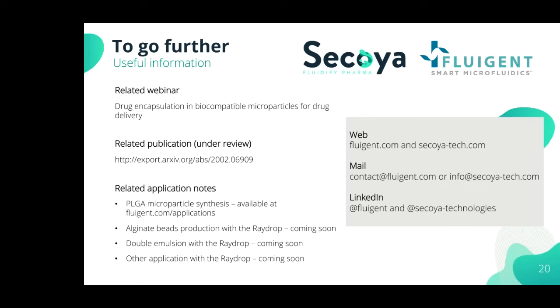Is a Raydrop sizer available online? Not yet, but yes, we plan to make it available online as soon as possible.